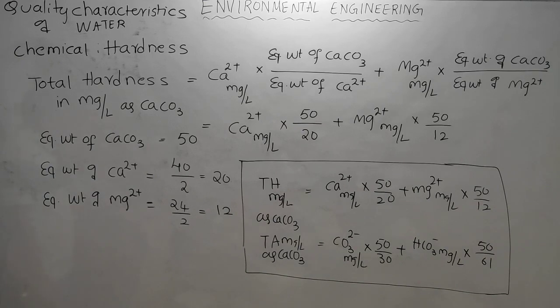So the titrant we use to find the hardness is EDTA.